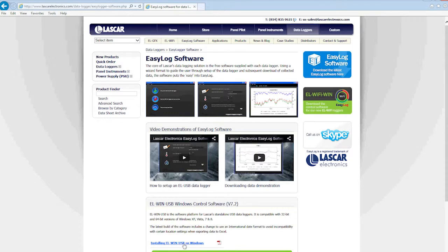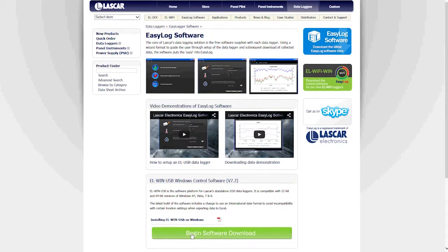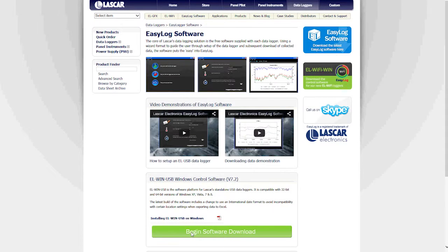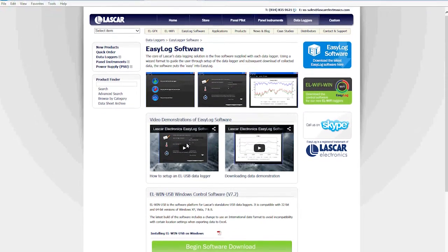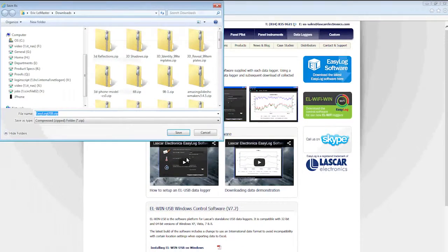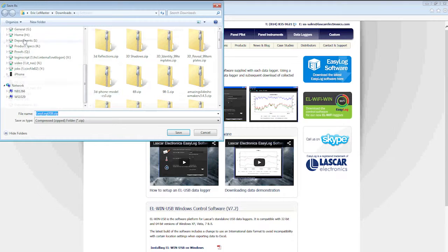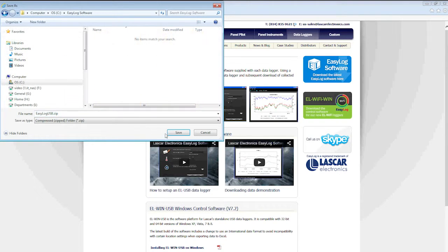Towards the bottom of the page, there is a box that you can click on to begin the software download. When prompted, choose the Save As option. Then select the location to save the zip file and click Save.